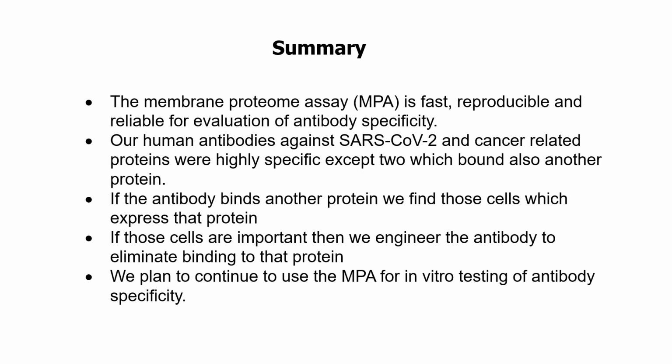So in conclusion, we plan to continue to use the assay for in vitro testing of our antibody specificity.